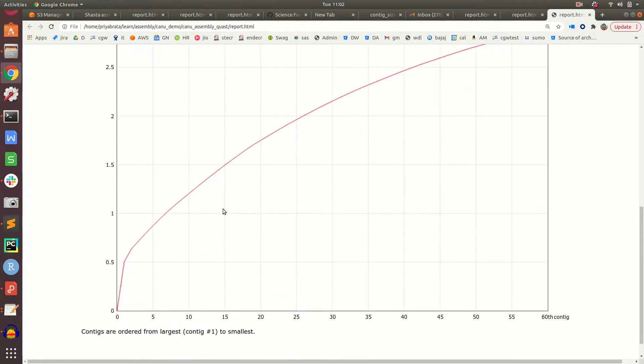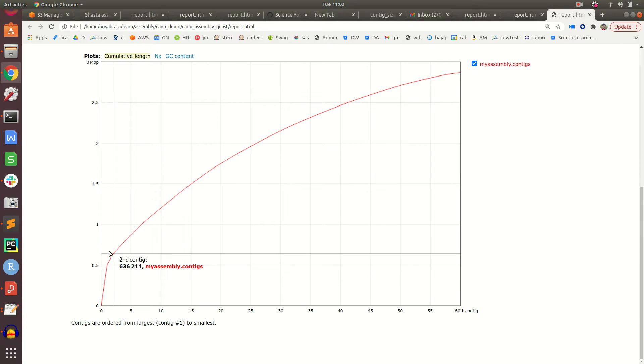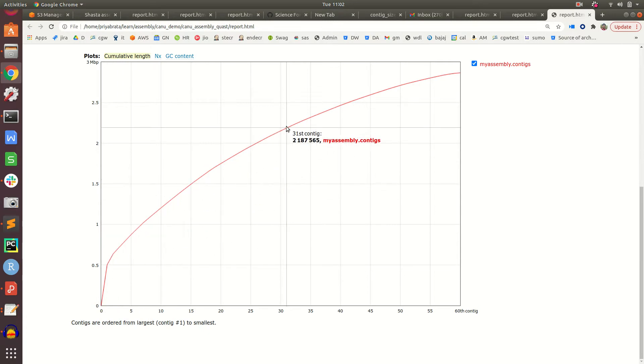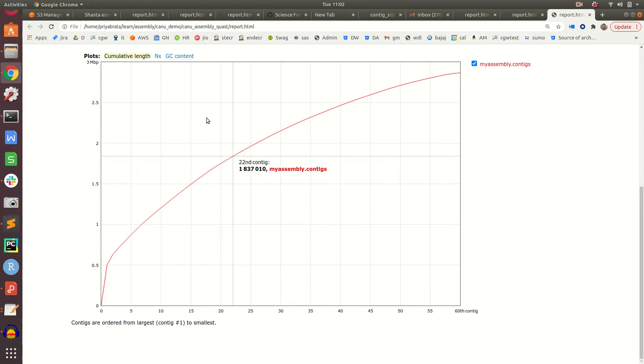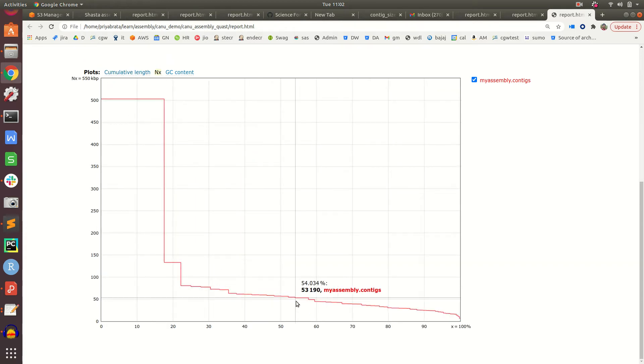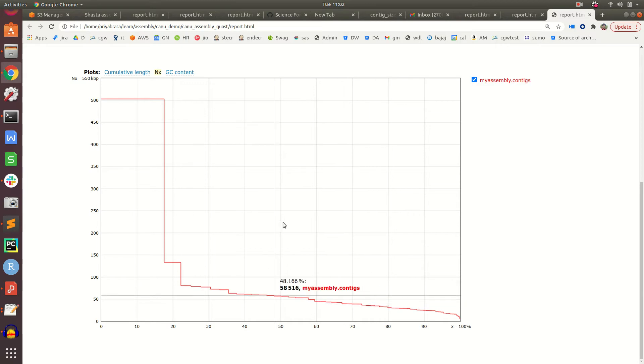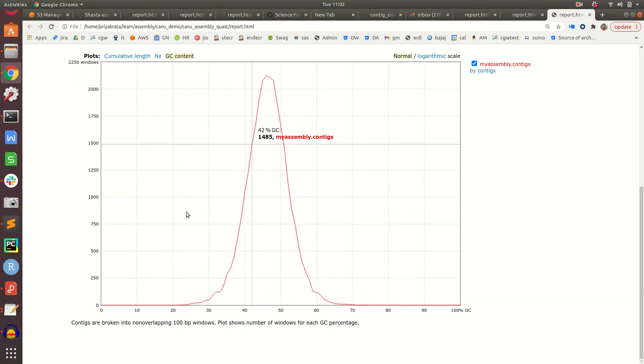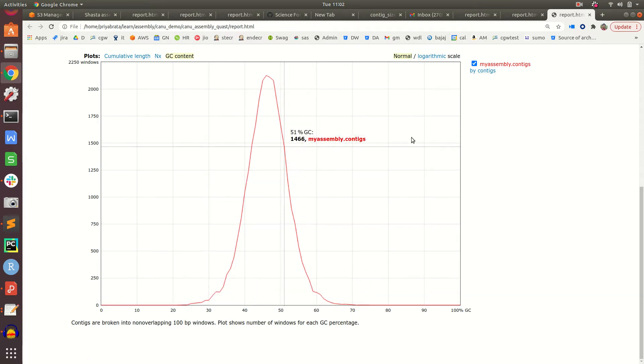This plot shows the cumulative assembly size as we add all 60 contigs. The next plot shows the distribution of N values - we have N50 here and N75 here.